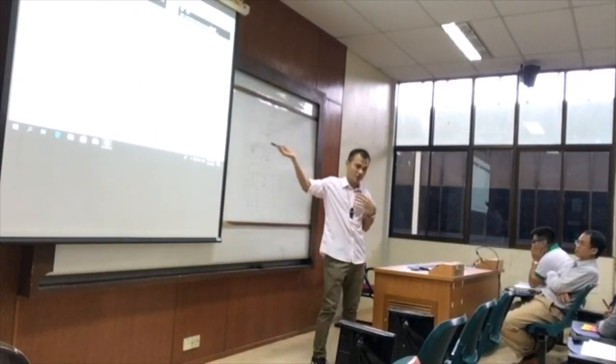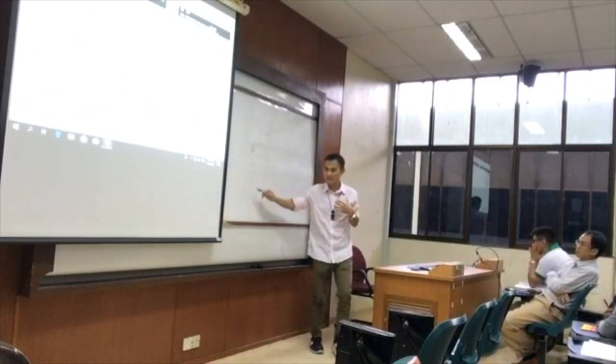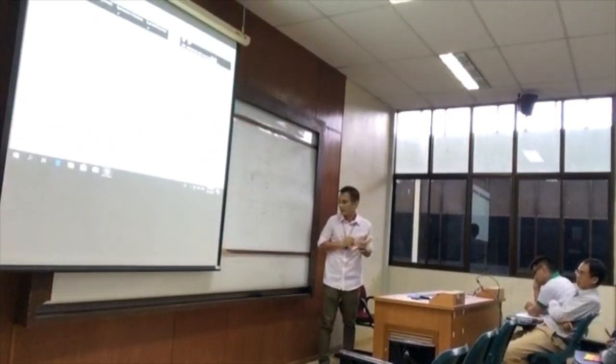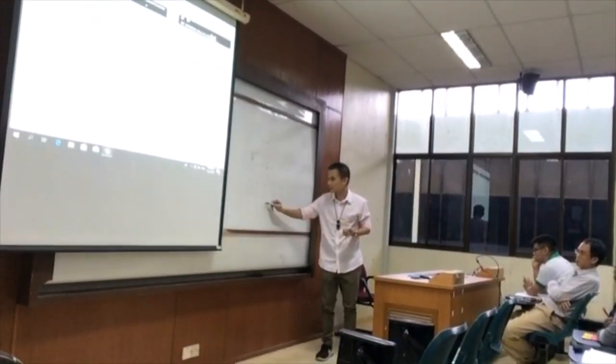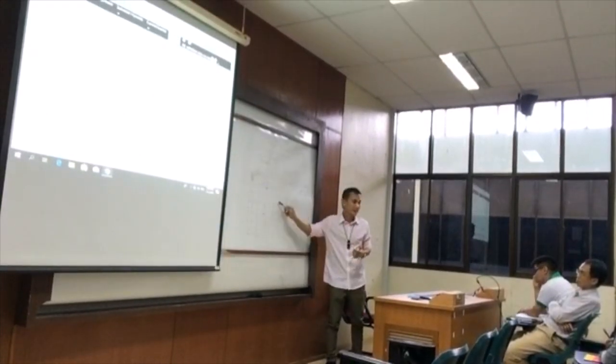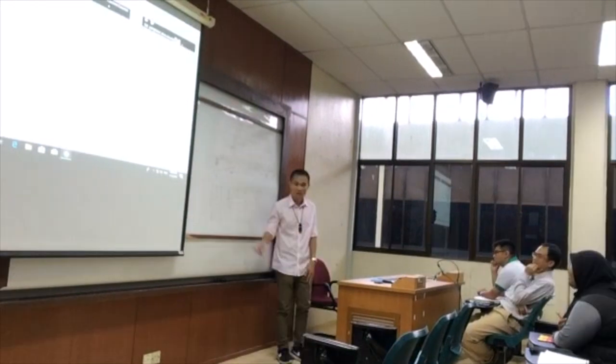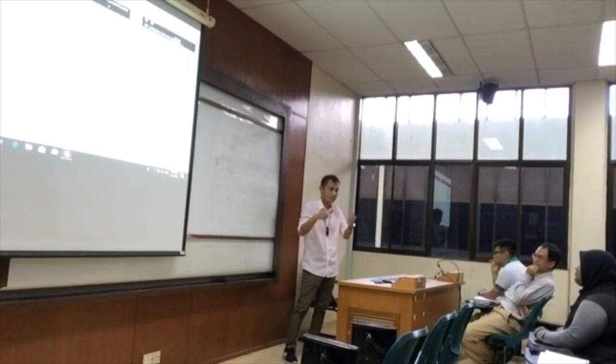I'm going to teach you about the process of the polymerase chain reaction, but it's going to be in the video. But this one is not in the video. Okay. But sometimes, guys, look. Sometimes all of them also become positive. The negative one should be negative, but now it becomes positive. So what can be the problem here?